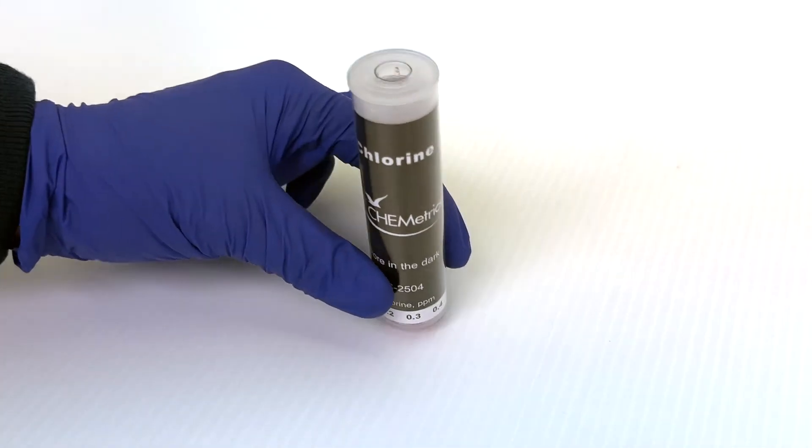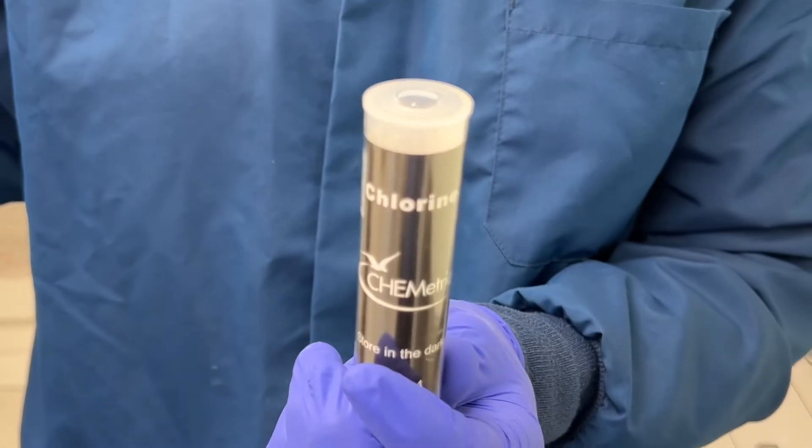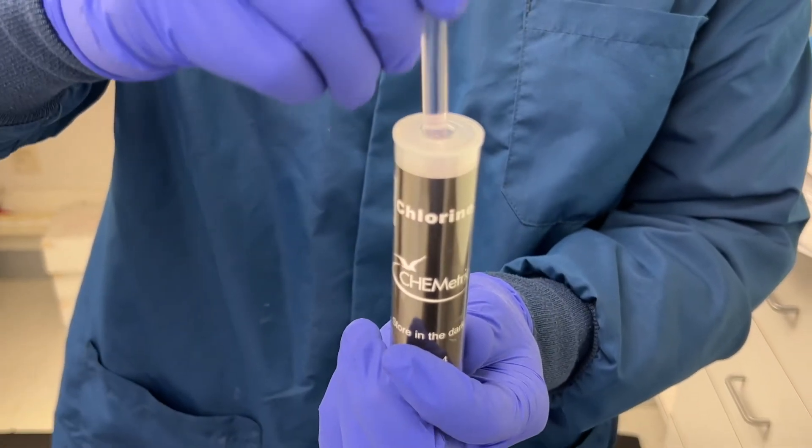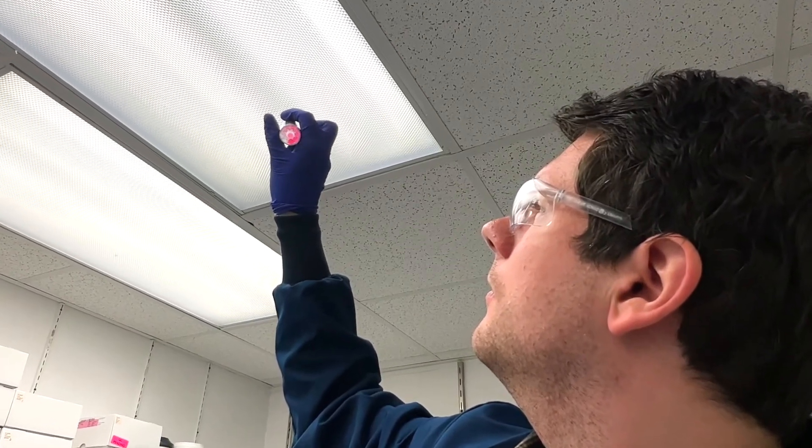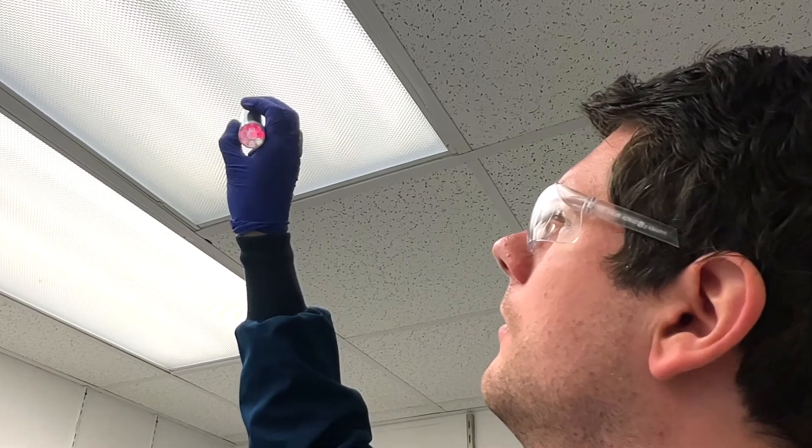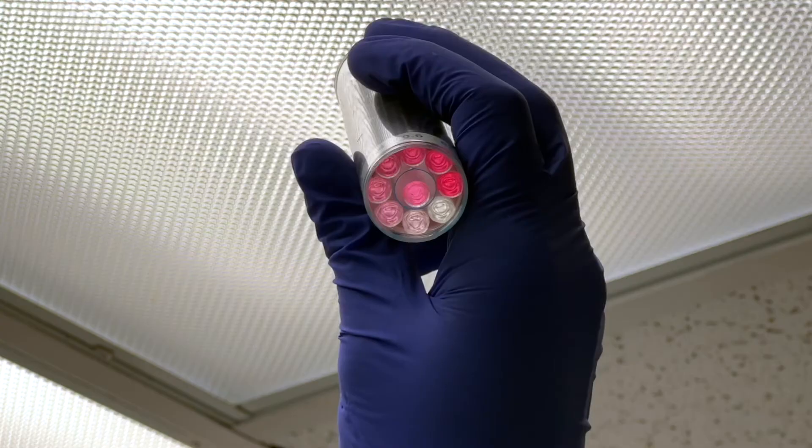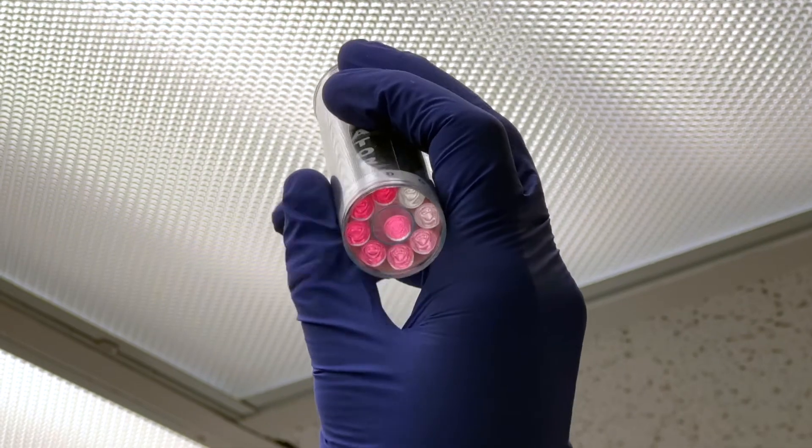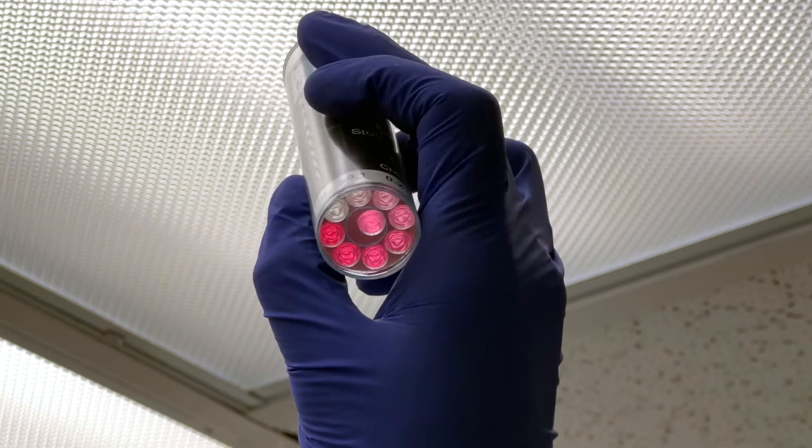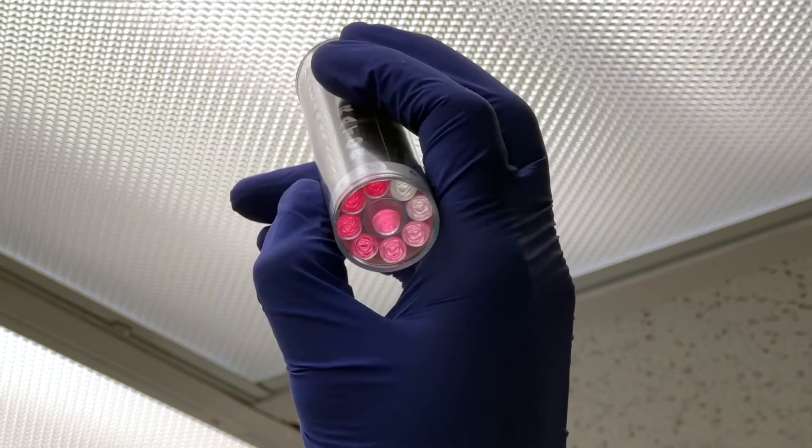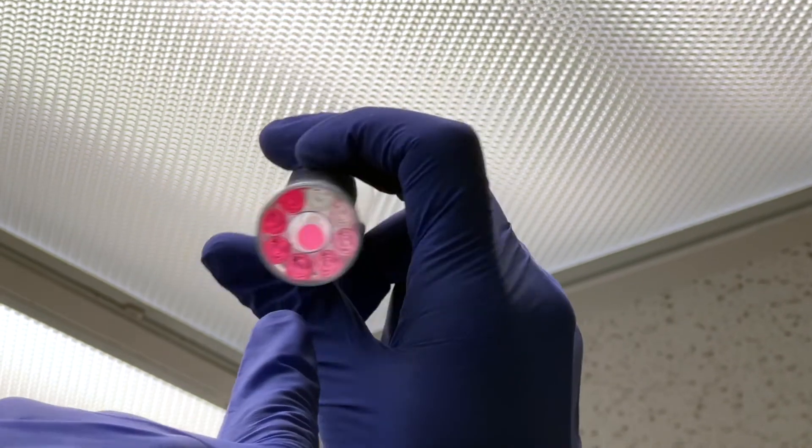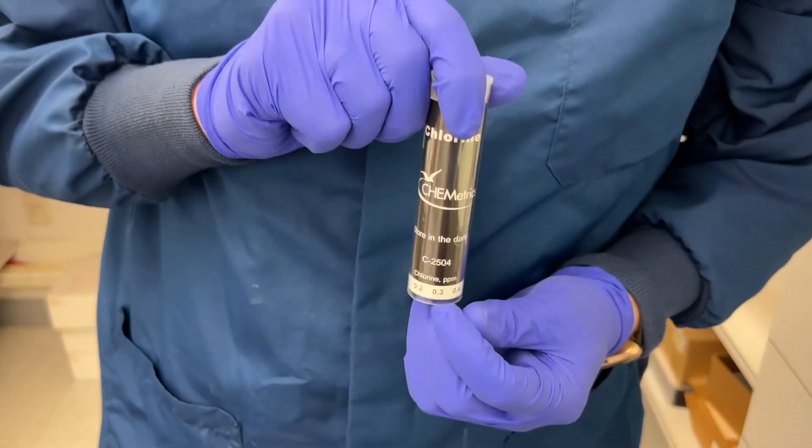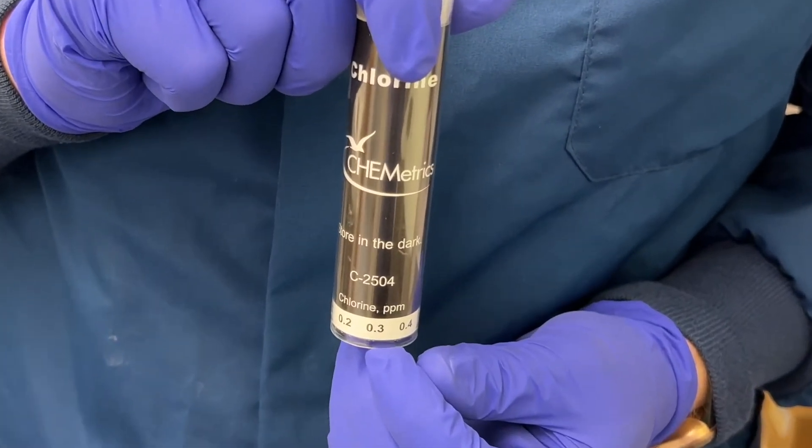When reading a round or low-range comparator, insert the ampoule flat-end first into the comparator, point the comparator toward the light source, and view from the bottom. Align the test ampoule directly above the color standard with the lowest concentration, then slowly turn the comparator counterclockwise until the intensity of the test ampoule's color matches a color standard or appears to be in between those of two color standards. Look to the bottom of the comparator to determine your result.